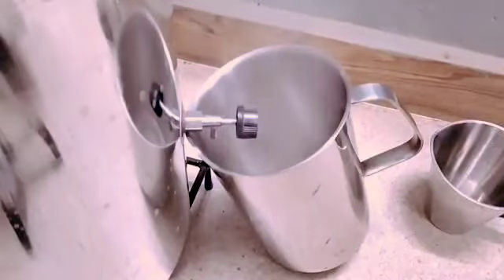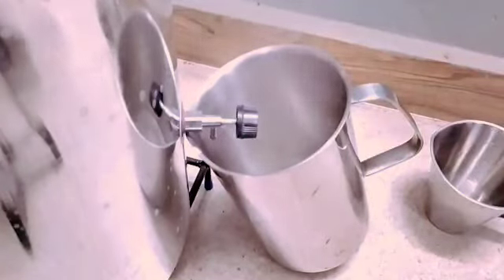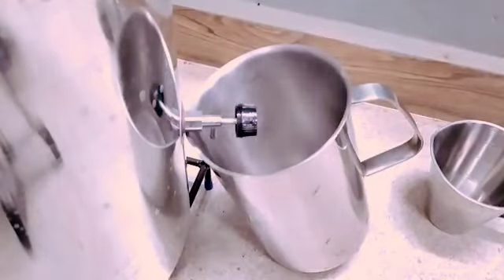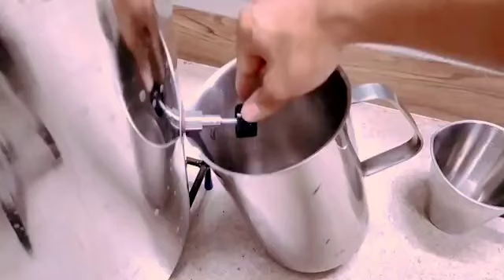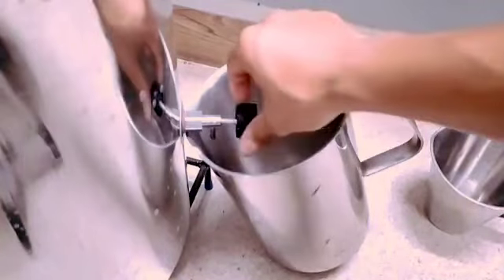Once the steam and water cease to freely come out of the valve, close the screw knob of the valve tight. Removal of steam and water from the autoclave chamber creates a vacuum environment within the autoclave, which will in turn facilitate complete extraction of residual steam from the contents inside the autoclave.